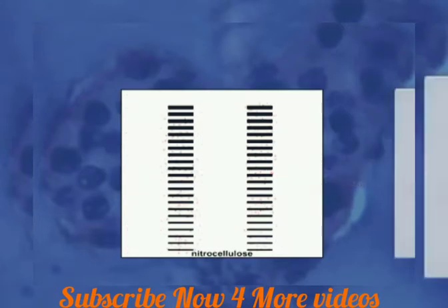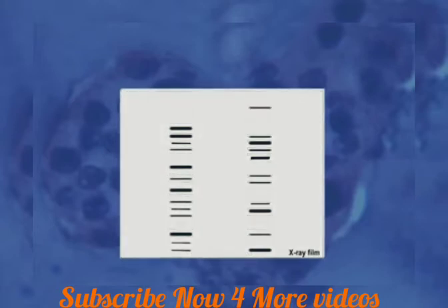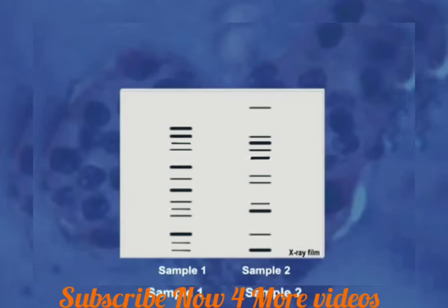The blot is then exposed to an X-ray film. Fragments of DNA that have bound the probe appear as dark bands on the film. As seen here, the samples designated 1 and 2 have a different pattern of bands, indicating that they came from two different individuals.